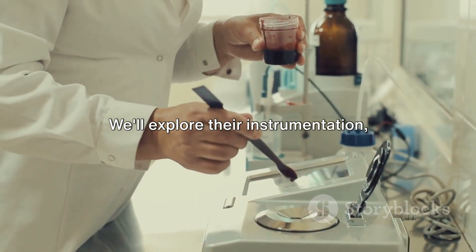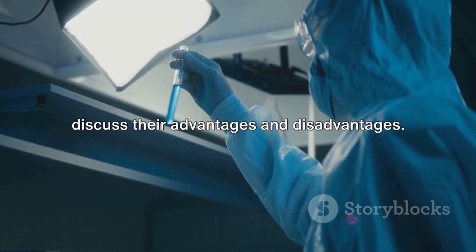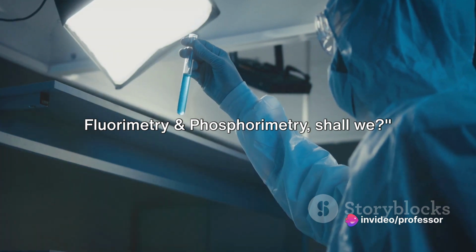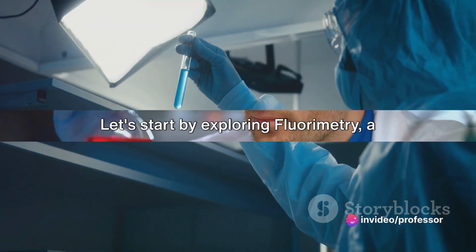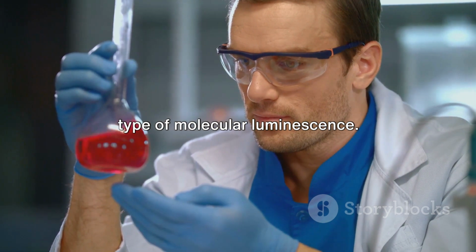We'll explore their instrumentation, delve into the quantitative aspects, and discuss their advantages and disadvantages. So let's dive into the world of fluorimetry and phosphorimetry, shall we? Let's start by exploring fluorimetry, a type of molecular luminescence.